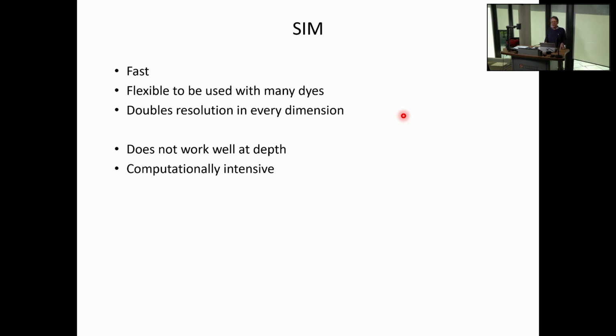With STED also, you need a dye that is depletable and works in wavelength regions that you can address with available light sources. SIM has no such demands. Any dye that works in normal fluorescence will work with SIM. It doubles resolution in every dimension and improves contrast dramatically.